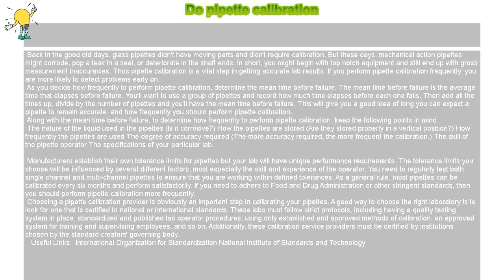Choosing a pipette calibration provider is obviously an important step in calibrating your pipettes. A good way to choose the right laboratory is to look for one that is certified to national or international standards.